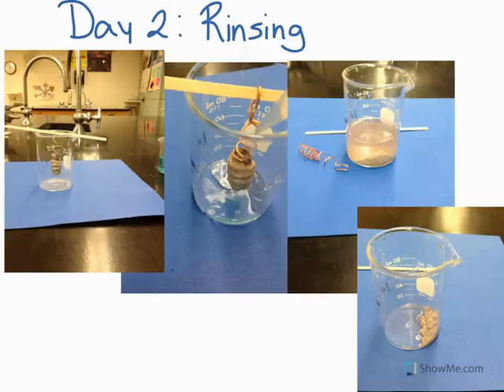The second day of the experiment, what you'll do is you'll take your beaker with your copper solution and your silver out of your drawer, carefully remove the copper wire and put it into your 150 milliliter beaker, and then rinse the silver that has formed into your 150 milliliter beaker. It's going to look rather cloudy afterwards, like this.